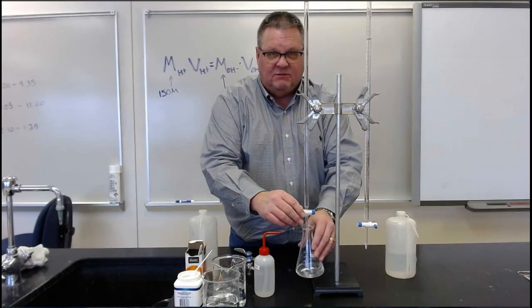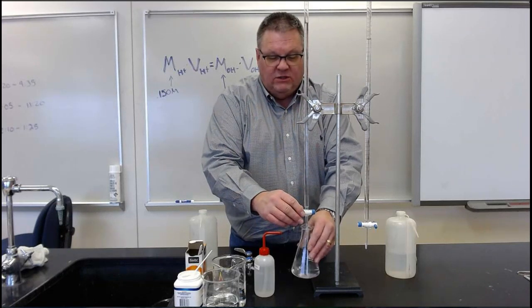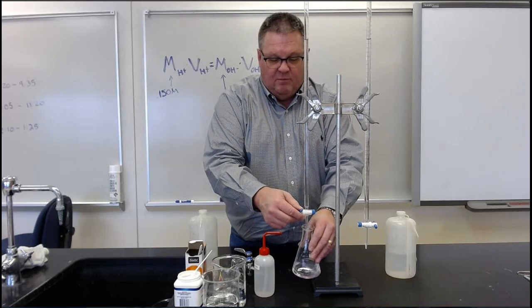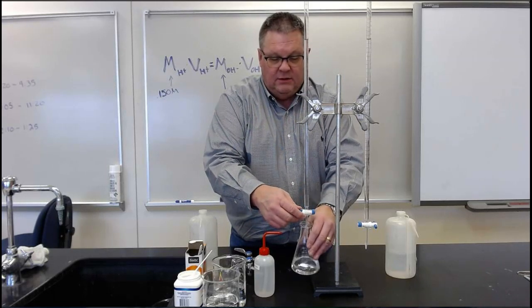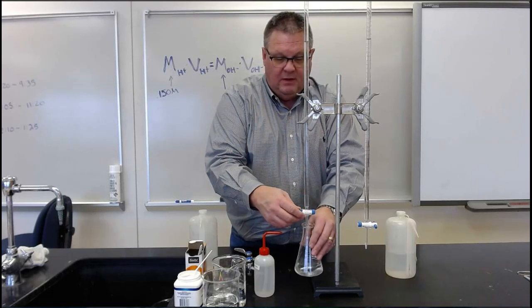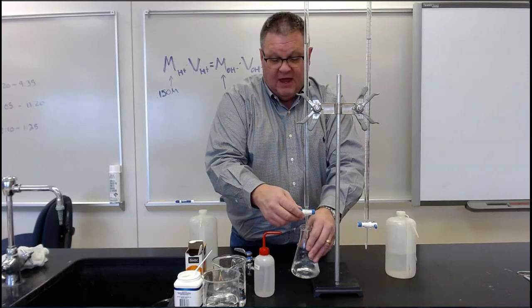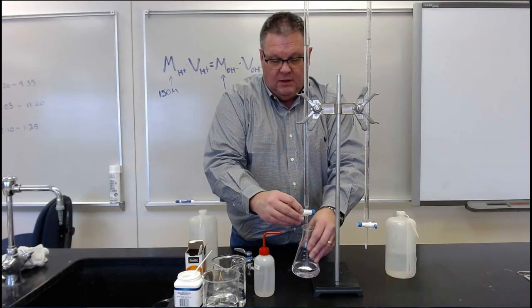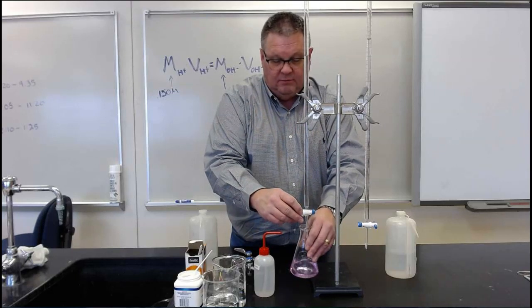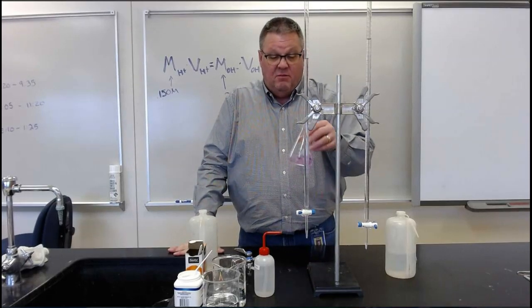And when I add base, I'm swirling the entire time. And what you'll notice is it'll start to turn pink, and then that pink will go away. And as you add more, it'll stay pink longer. You're getting close to the end point at that point, okay? And what you're after is hitting the exact lightest perceivable pink. And with swirling, it has to stay a minute.